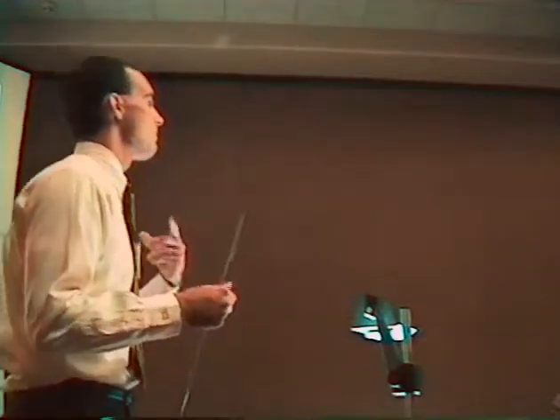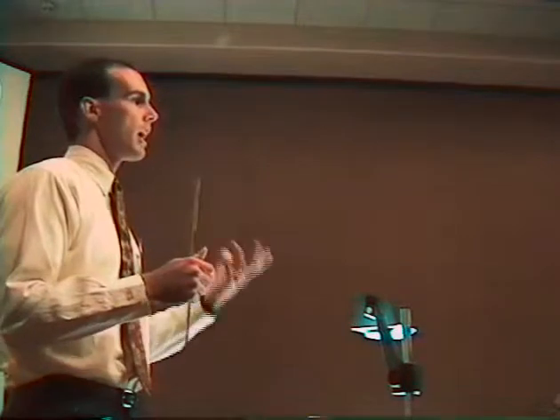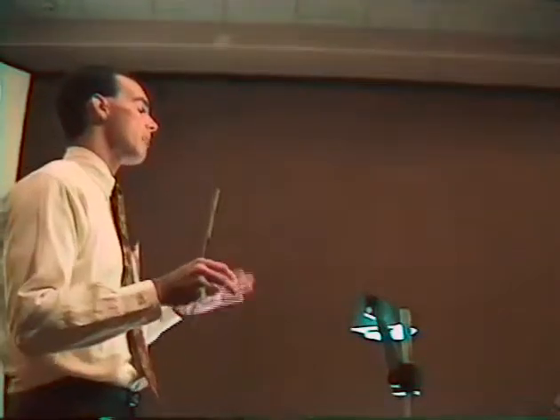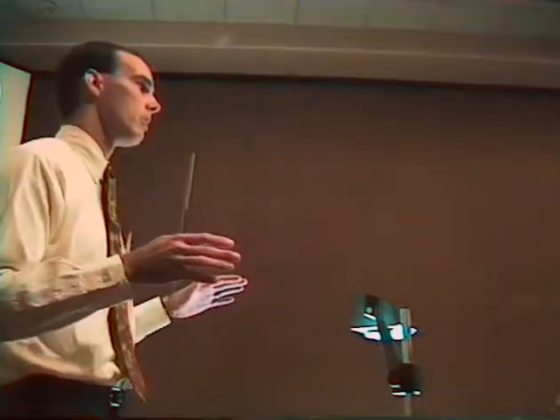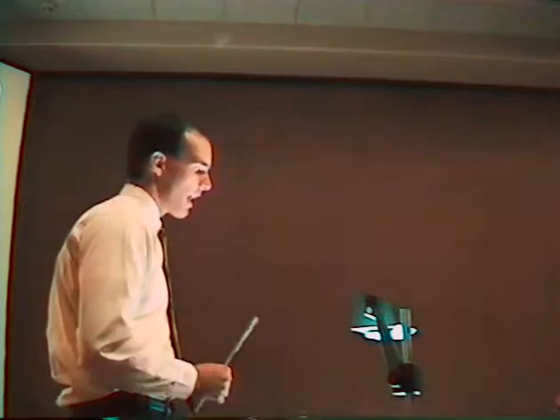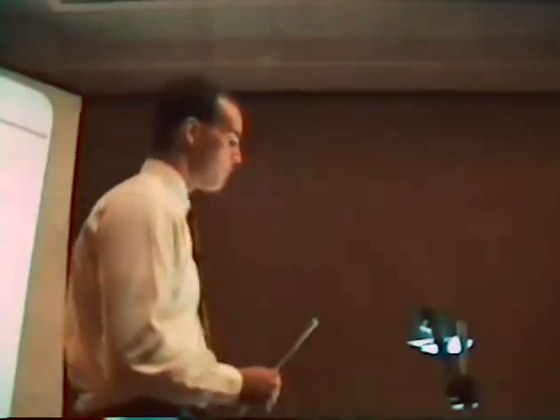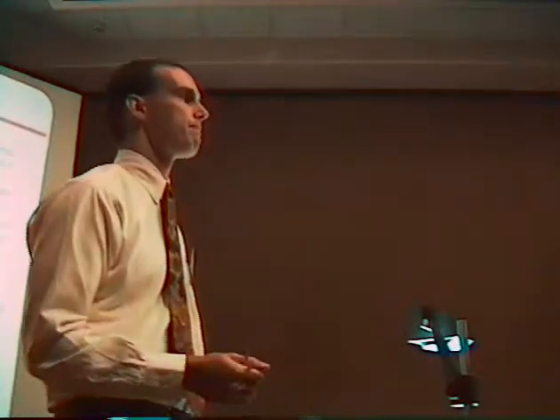In contrast, if you vacuum dry these catalysts so that the decomposition occurs in an environment where there are not these NOx species, then you form a cobalt silicate which under the right conditions can be reduced to form a highly dispersed cobalt phase on the surface. The final conclusion we're able to draw is that the highest concentration of reducible cobalt surface area is for a sample that is vacuum dried and vacuum annealed at 400 degrees C.